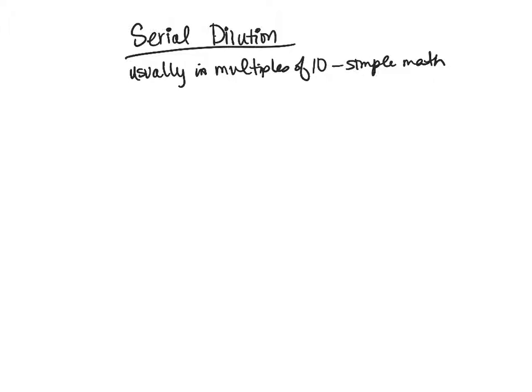The number of serial dilutions is chosen based on a preliminary estimate of the culture density. If someone is growing something in a broth and it's very thick and very cloudy, so likely there's a lot of growth in it, then they might do a series of 10 or 20 serial dilutions. But if it's a very lightly cloudy broth, a person might do only 5 serial dilutions, just to make sure that they get a plate that has something between 30 and 300 colonies.